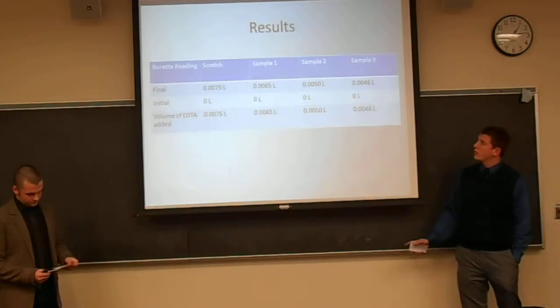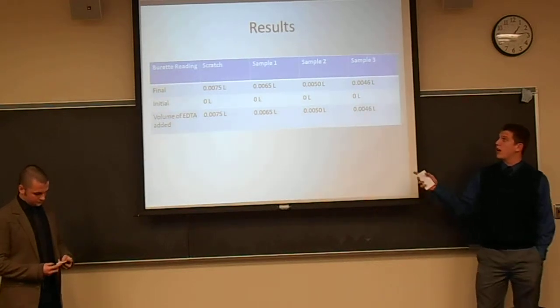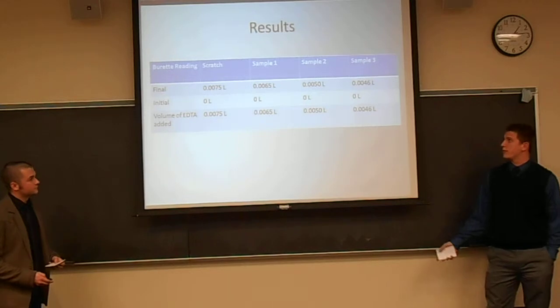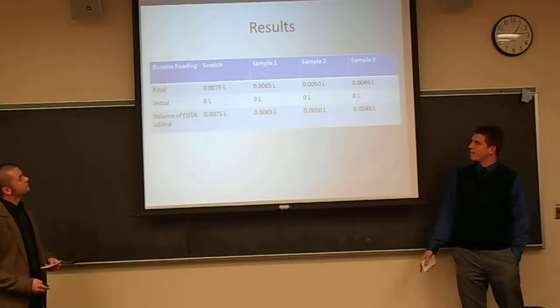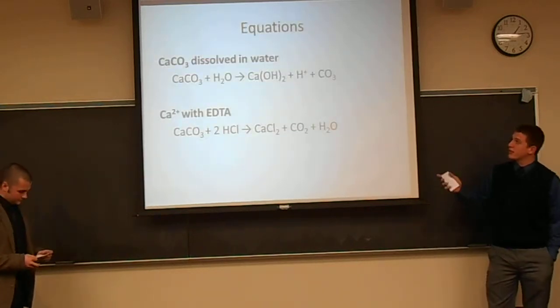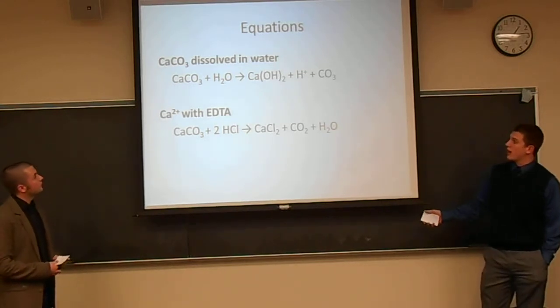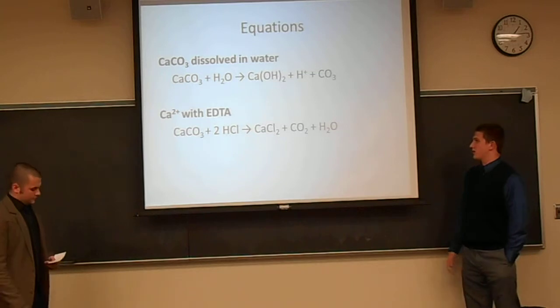This is our results table. Sample 2 was the best blue color that we got out of the 4. These are the equations of the reactions: the calcium carbonate and the calcium with the EDTA.